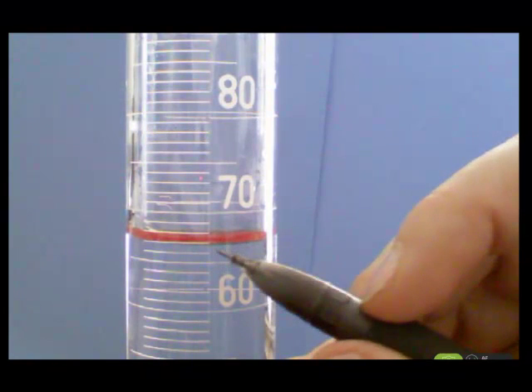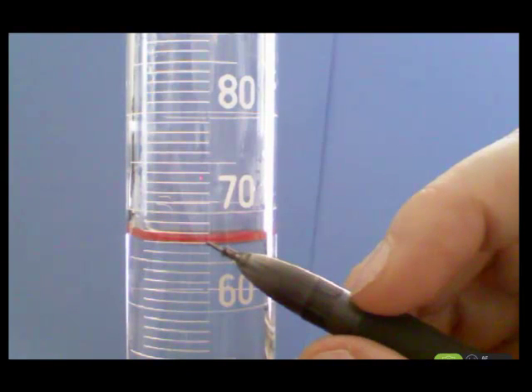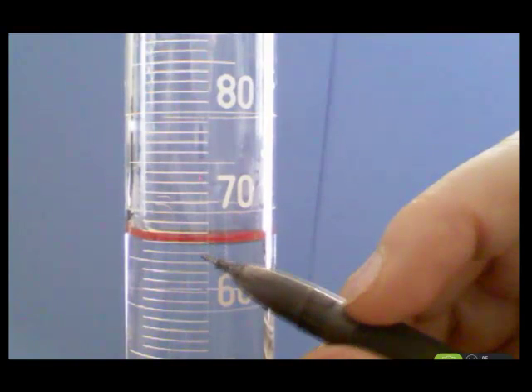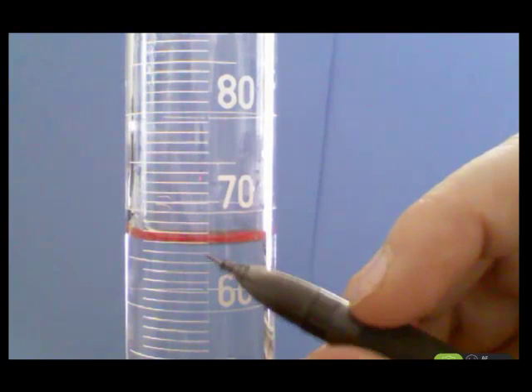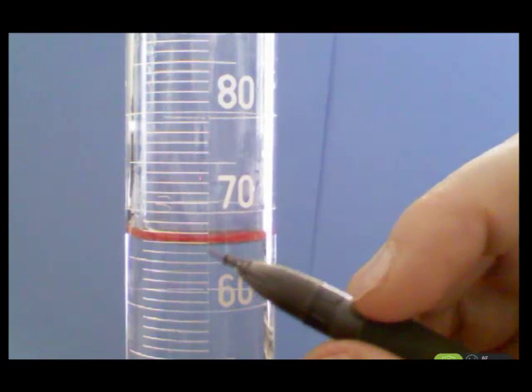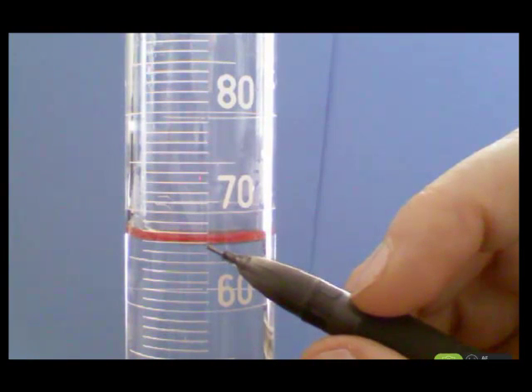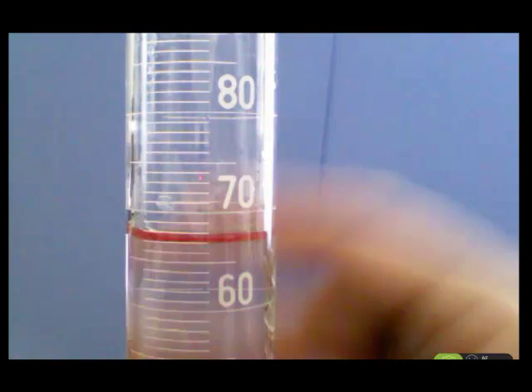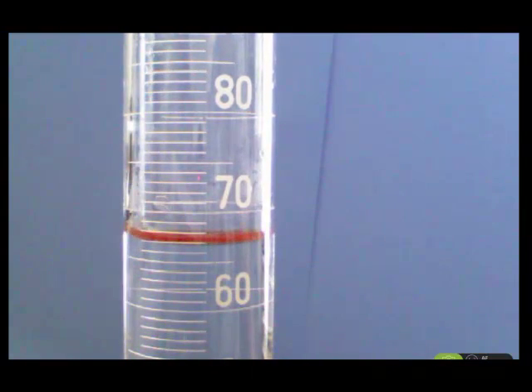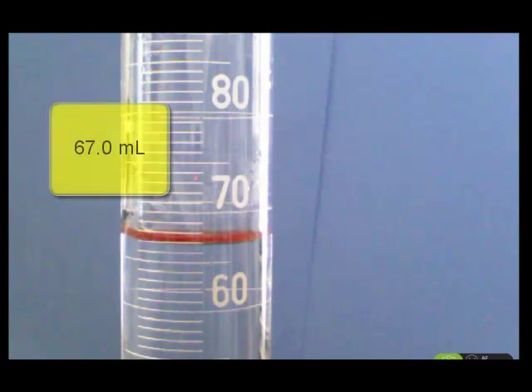Now, the bottom of the meniscus is lined up with the second small line past the 65. So we would go 65, 66, 67. So there's 67 milliliters of water in this graduated cylinder. Now, you do not record 67, you record 67.0.